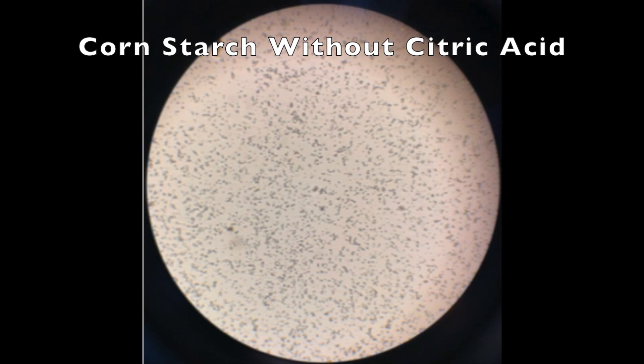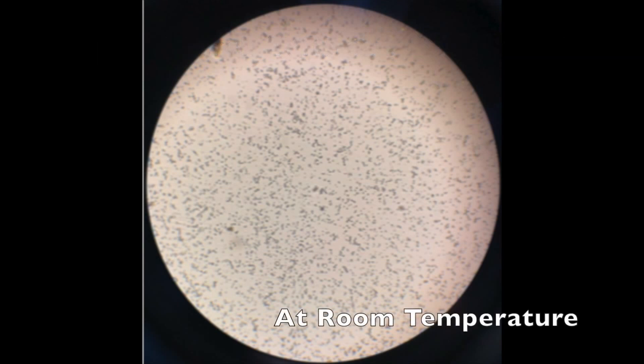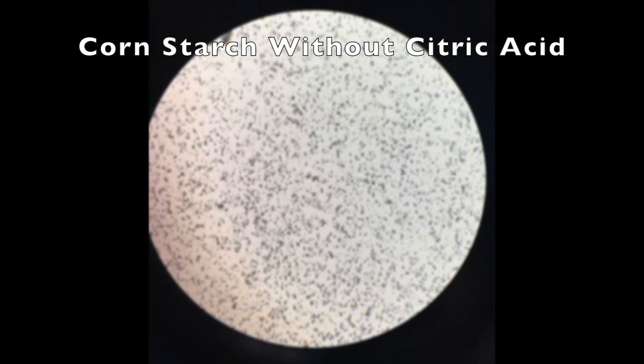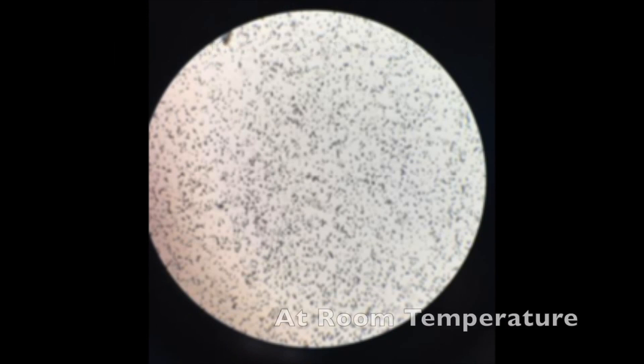Now we push the stage up and start with the lowest magnification to try to find our sample.